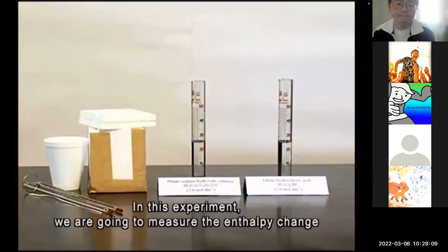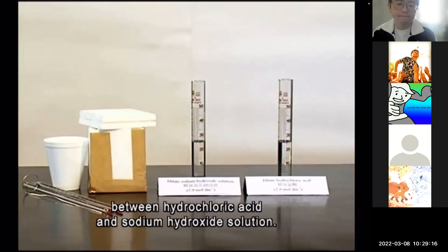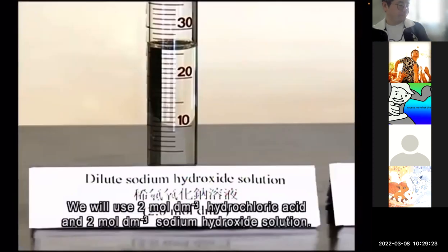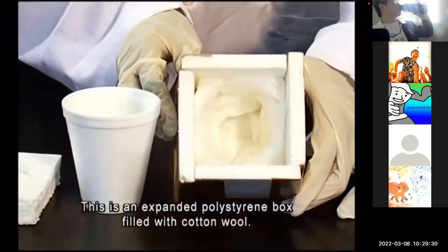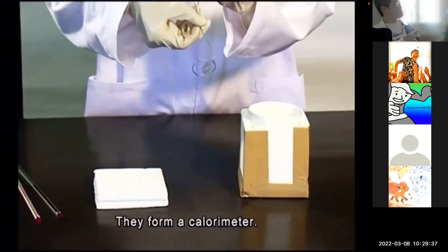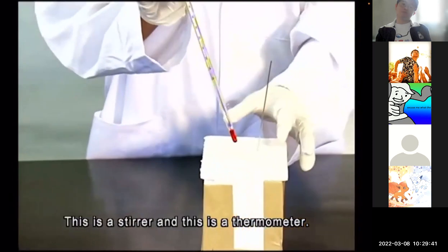In this experiment, we are going to measure the enthalpy change accompanying the neutralization reaction between hydrochloric acid and sodium hydroxide solution. We will use 2 moles per cubic decimeter hydrochloric acid and 2 moles per cubic decimeter sodium hydroxide solution. This is an expanded polystyrene box filled with cotton wool. This is a plastic cup. They form a calorimeter. This is a stirrer, and this is a thermometer.